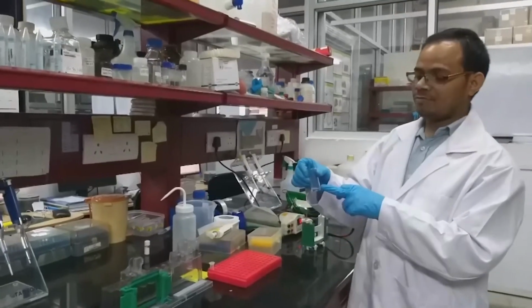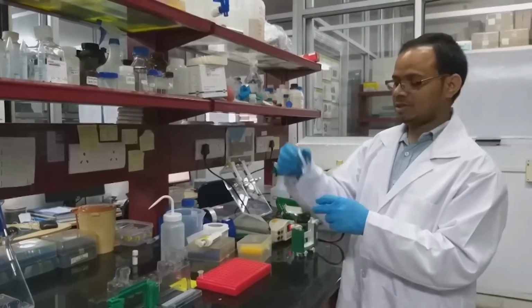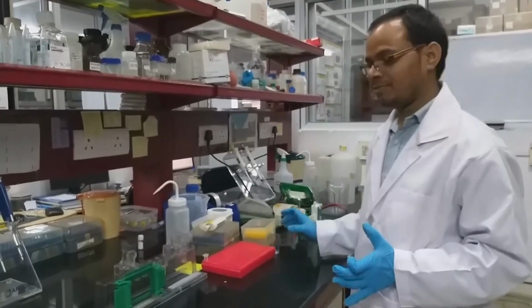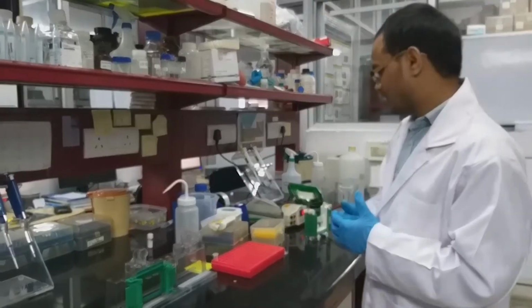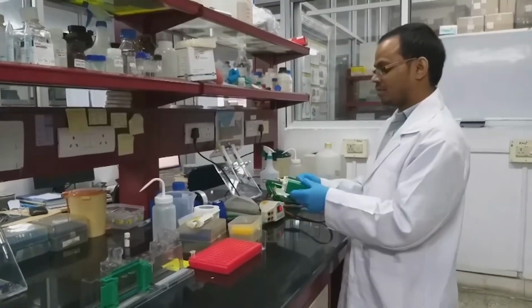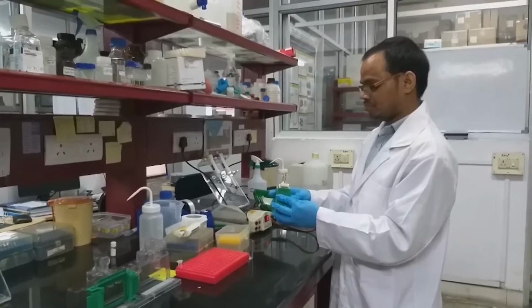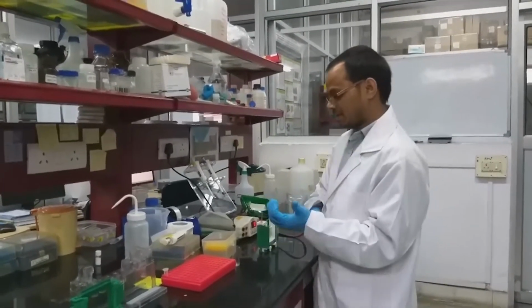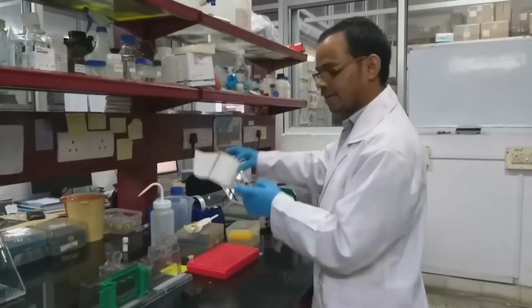This is the remaining stacking gel solution. So we can see it is solidified. So that means the stacking gel also got solidified. We have to remove that gel and fix it into this one, and we have to keep it inside the tank. So I just take out the gel.